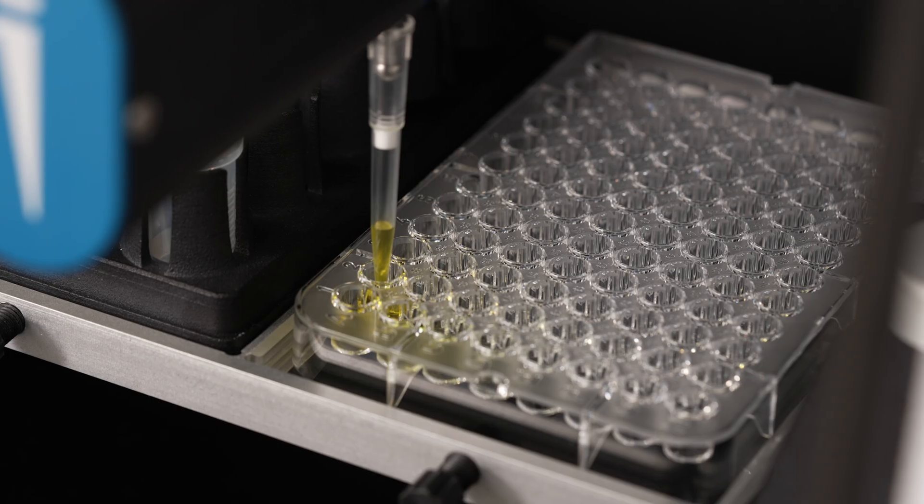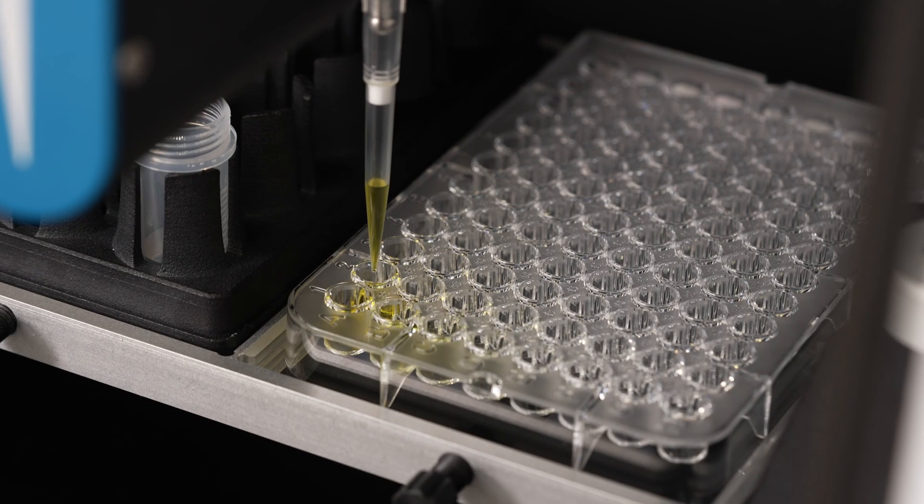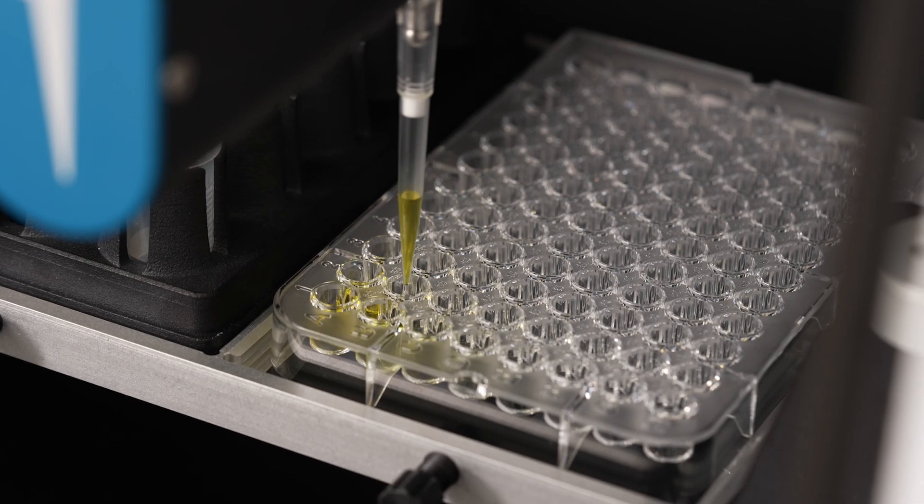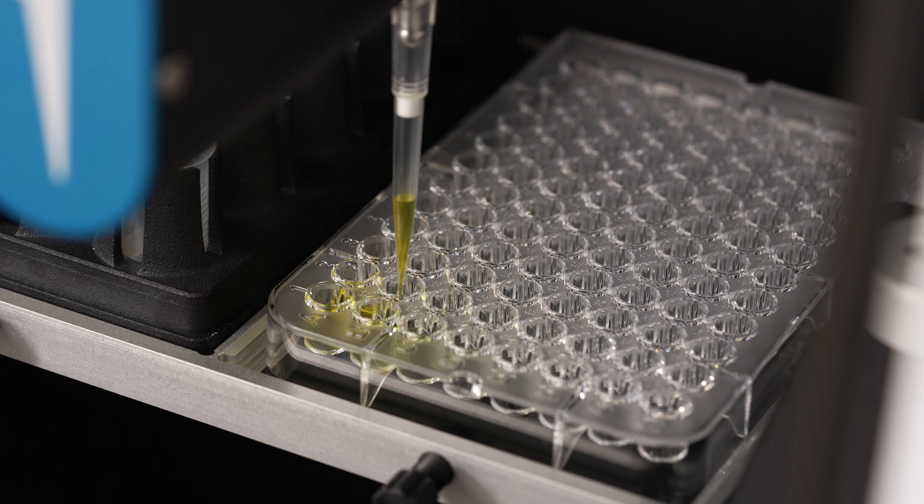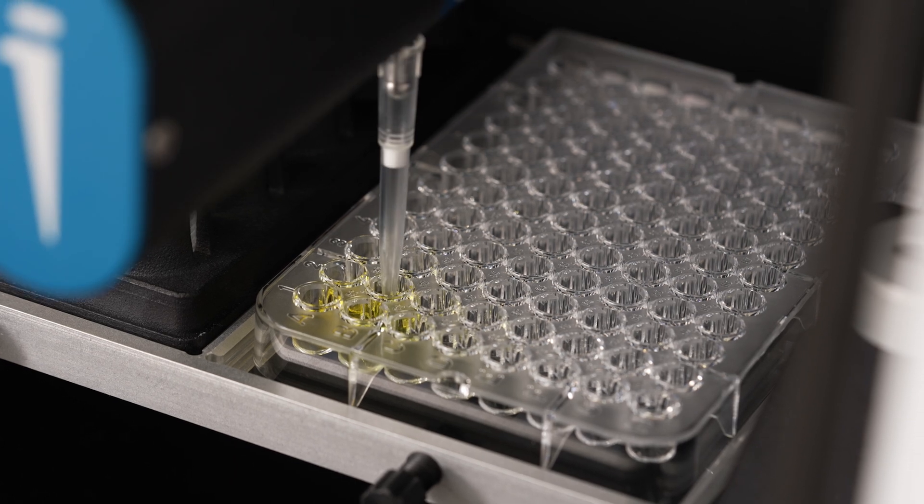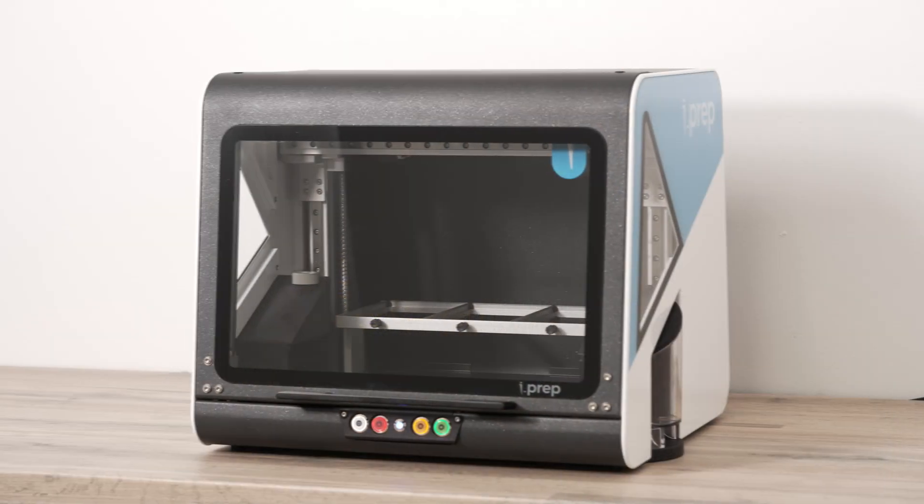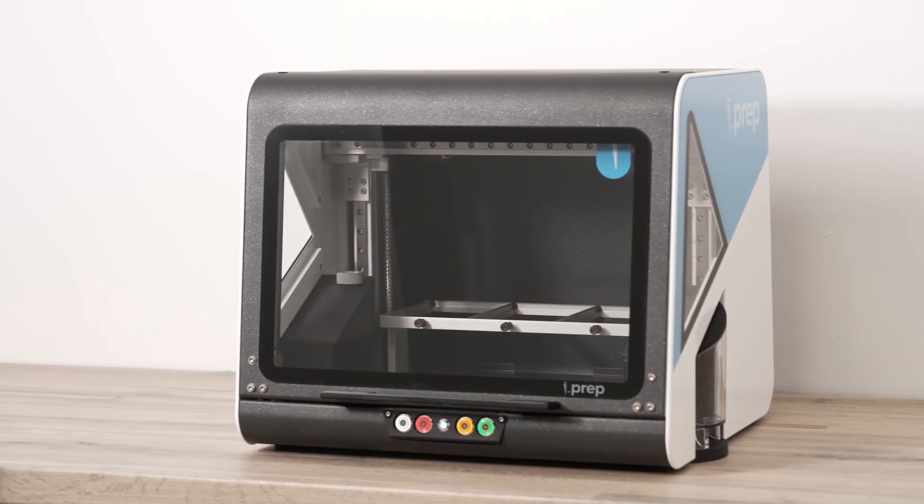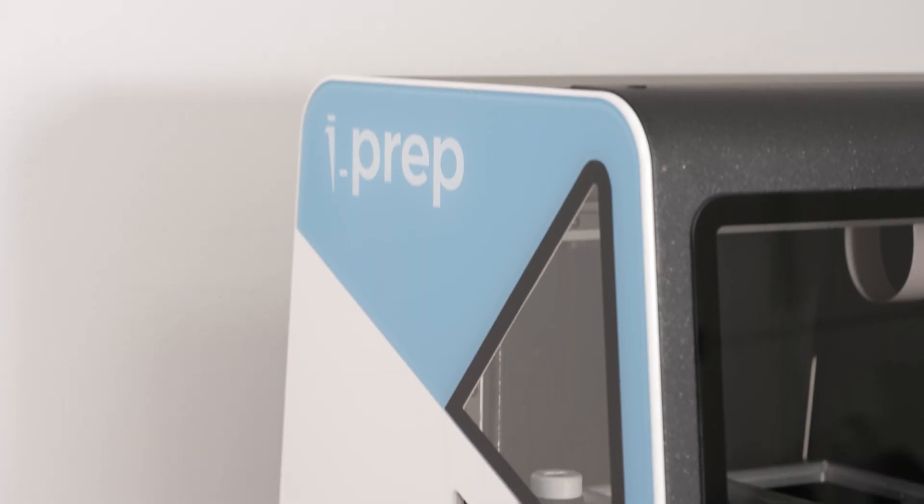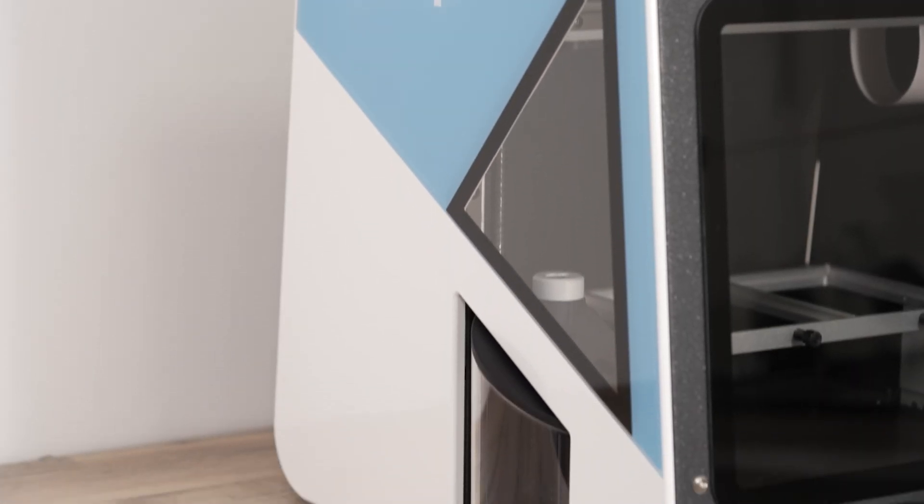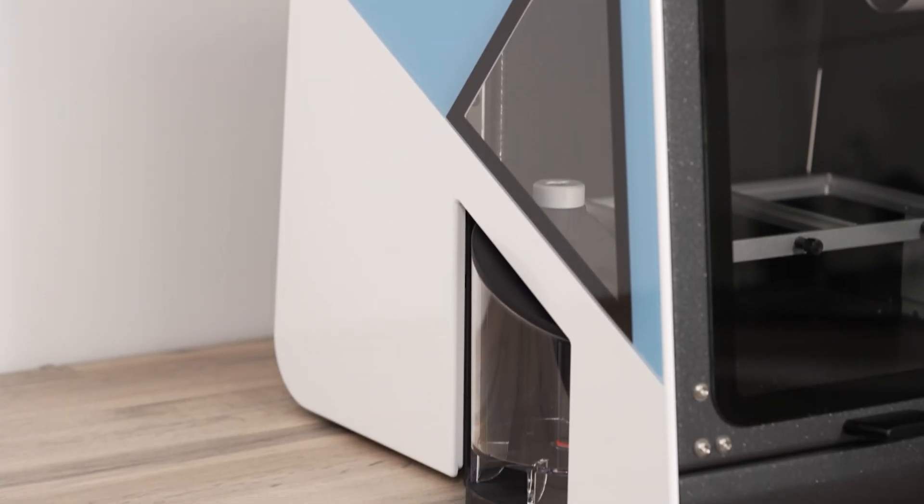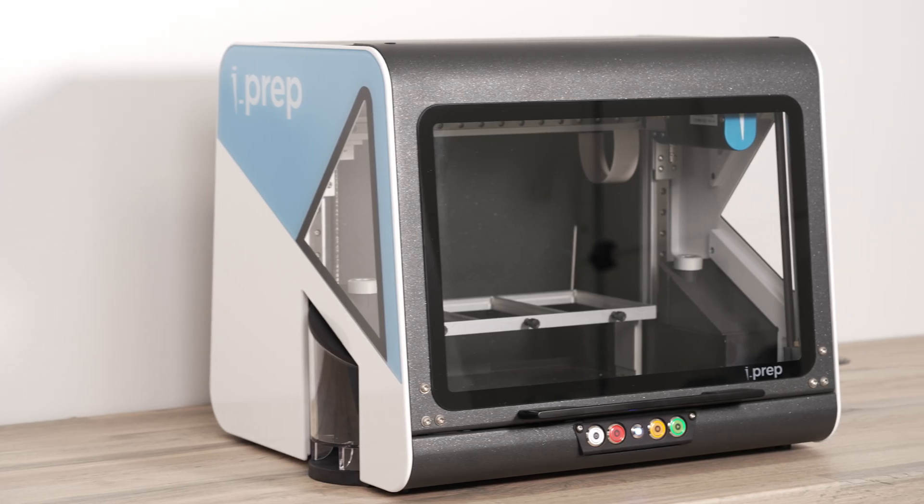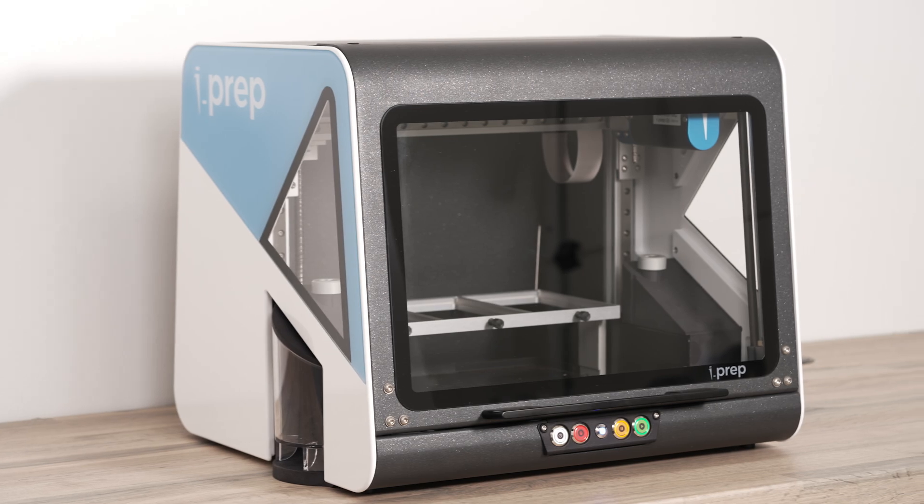If your lab currently uses handheld pipettes and you want to increase efficiency through automation, iPrep is the perfect step. Common applications include qPCR setup, ELISA assays, and cell culture applications. However, if your task requires pipetting, iPrep can help.